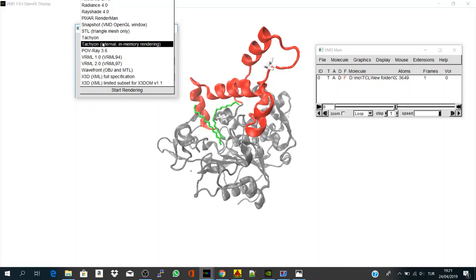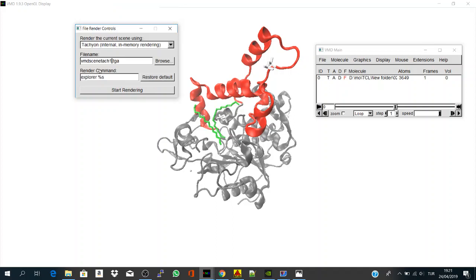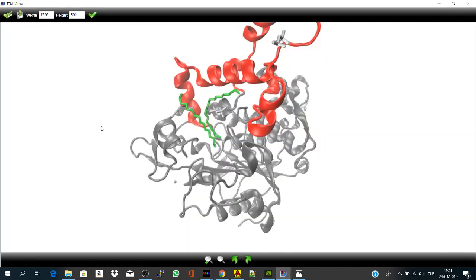So, if you choose Tachyon again, and let's start rendering, it will take a little bit. Yeah, and here you have your structure.